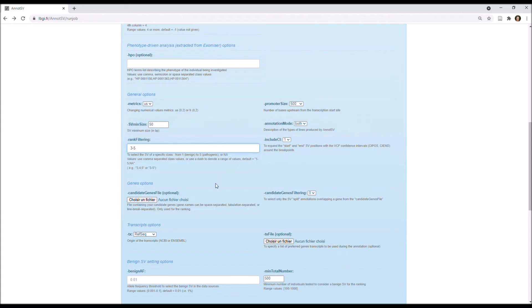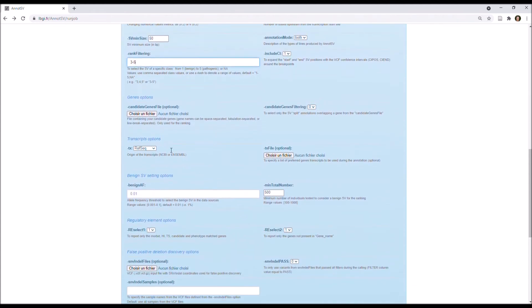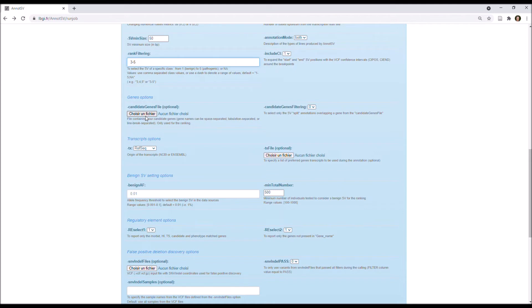You also have options specific to the genes, so you can upload a candidate genes file containing your candidate genes, your genes of interest, and this will be used during the ranking. Moreover, you can set the candidate genes filtering option to 1 to report only the split lines describing your gene of interest.